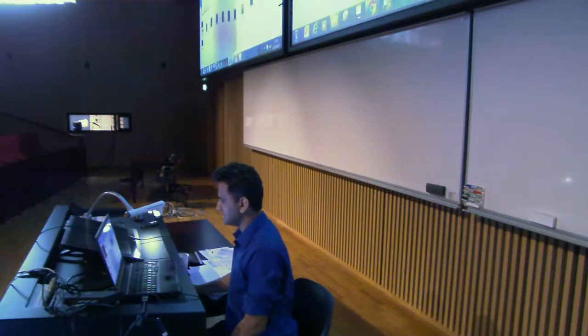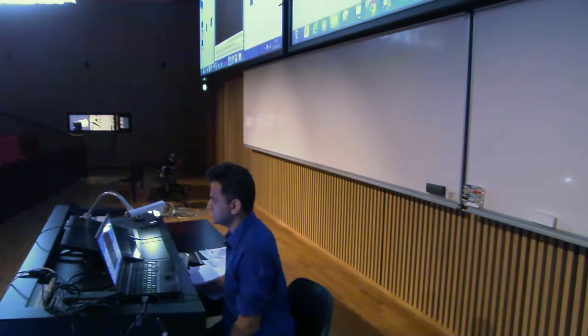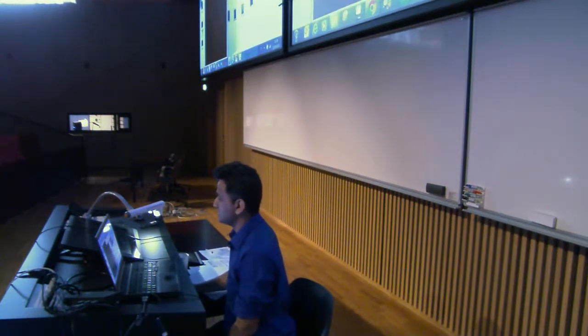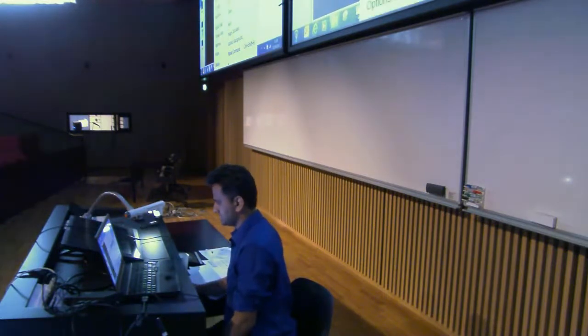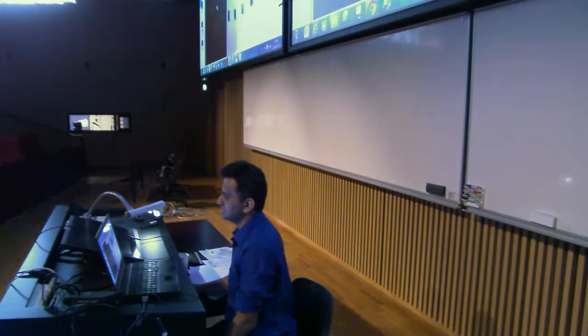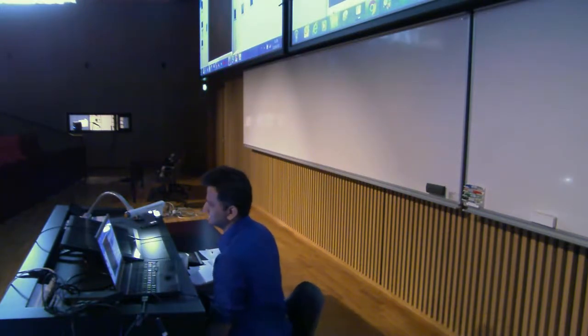Let's say if there are a lot of speckle noise, speckle is nothing but the high frequency component, like dots, so many dots, and you can actually filter that out. This is also kind of a frequency domain filtering, but there is one way. It's this shadow noise, and you can say despeckle. So inside despeckle, the algorithm will work. But again, it is not allowed to be used on raw data. Okay, just do it for the segmentation.